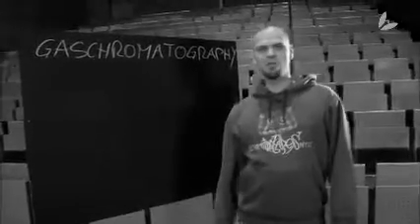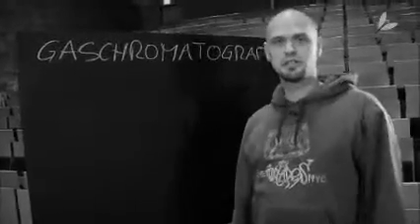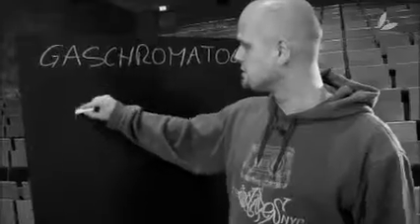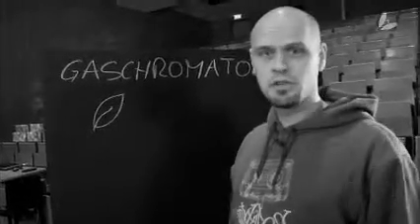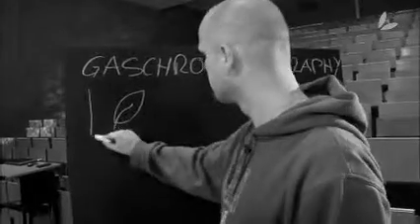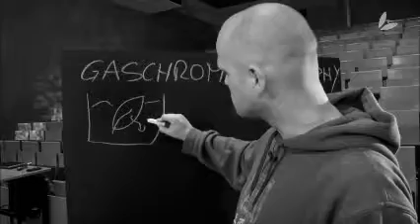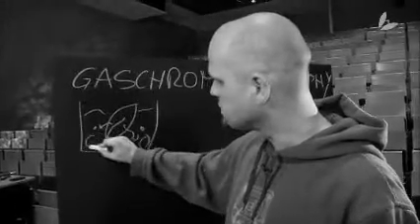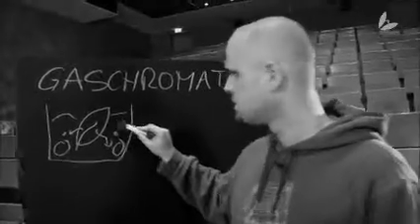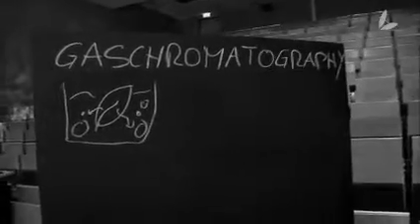Hello, I'm Alex. I'm from the Max Planck Institute of Molecular Plant Physiology. We are interested in the substances inside plants. First, we dissolve them in a liquid. There we get a mixture of small particles and big particles. To separate them, we use gas chromatography.